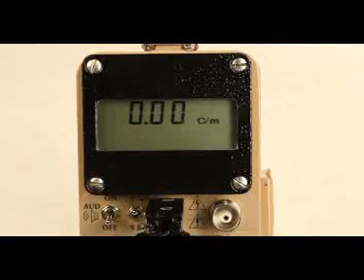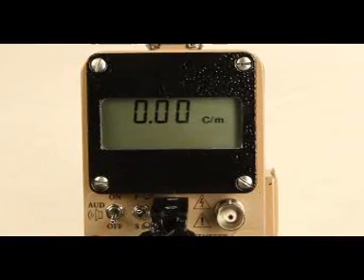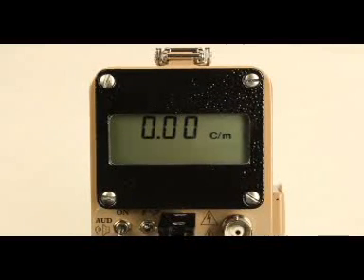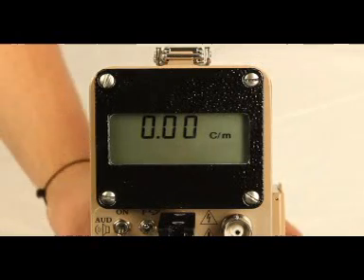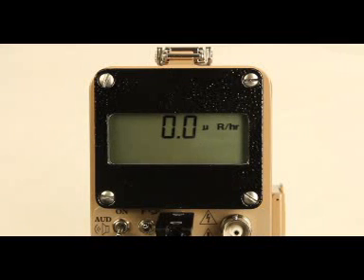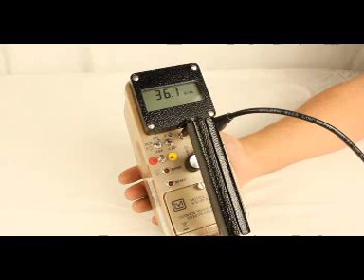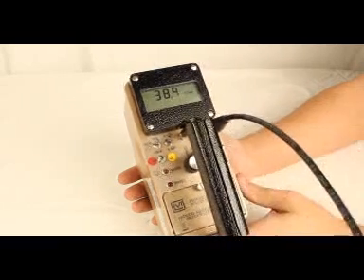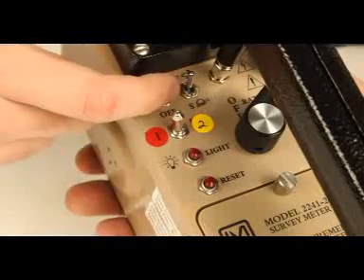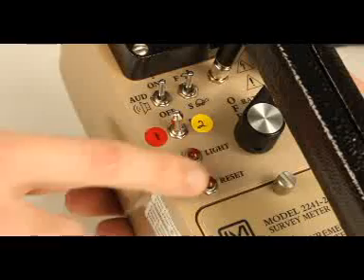The meter is preset with two alarms: a low alarm and a high alarm. These alarms are set at designated levels to notify the user to the presence and rate of radiation. The low alarm signifies a radiation reading significantly above background but still no immediate hazard. The high alarm indicates the presence of radiation with more of a significant hazard to human health. If the rate meter has increased above the preset alarm threshold, an audible continuous tone will accompany the flashing alarm display on the rate meter display.